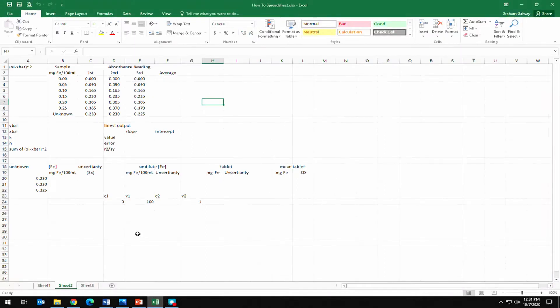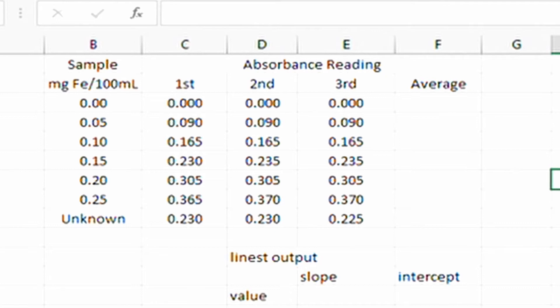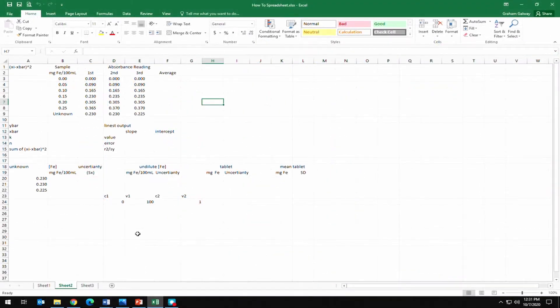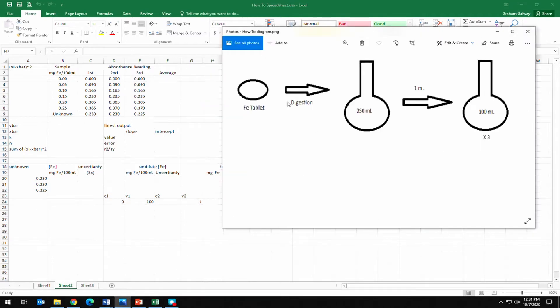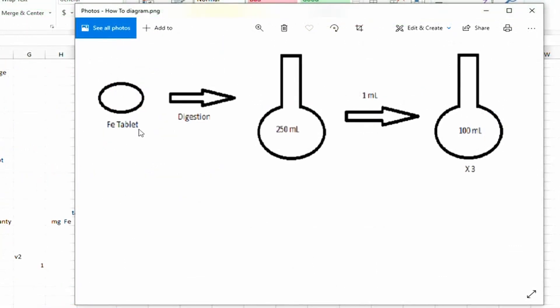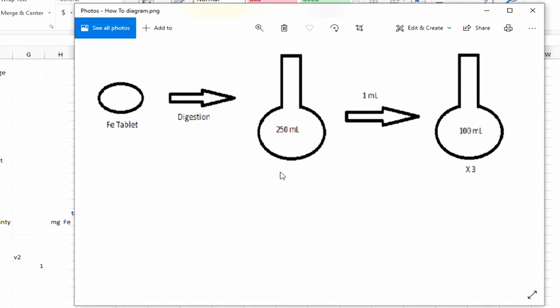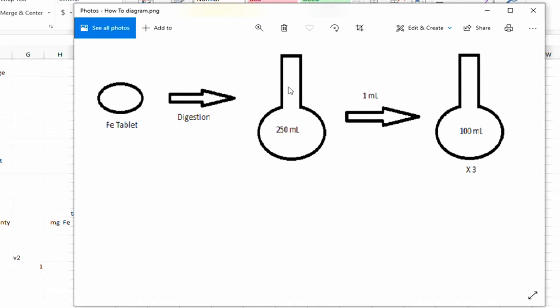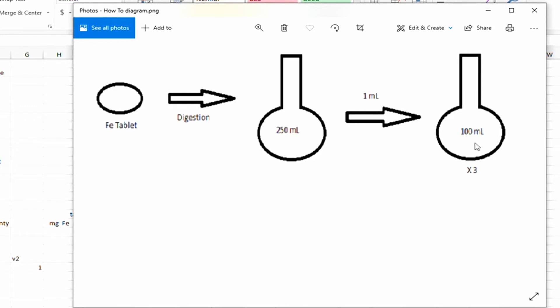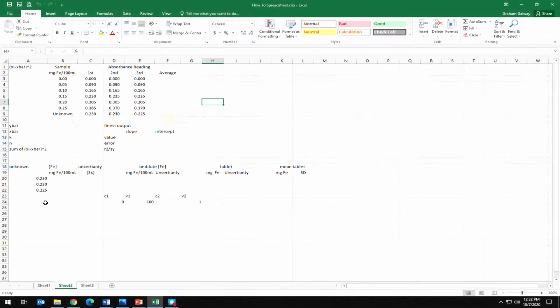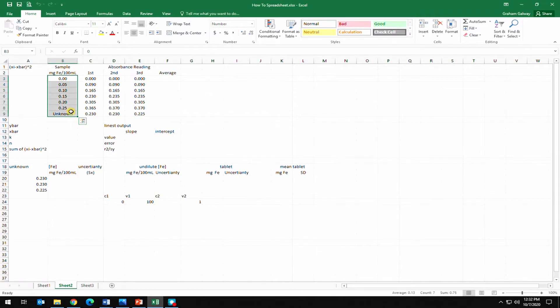Here in this spreadsheet is data collected during an experiment in CHEM 2303. In that experiment, an iron tablet was digested, the digestion solution was transferred quantitatively to a 250 mL volumetric flask made up to the mark, and then 1 mL was transferred to three 100 mL flasks, resulting in three unknown measurements. The spreadsheet has titles already set up, and we can see our standard data readings and the readings of our unknowns.